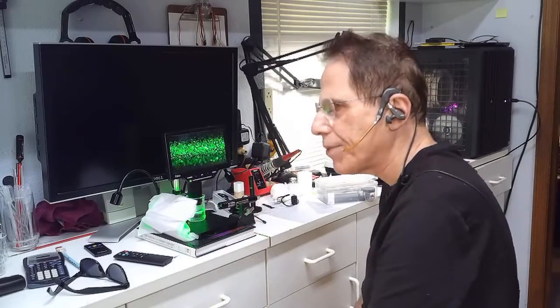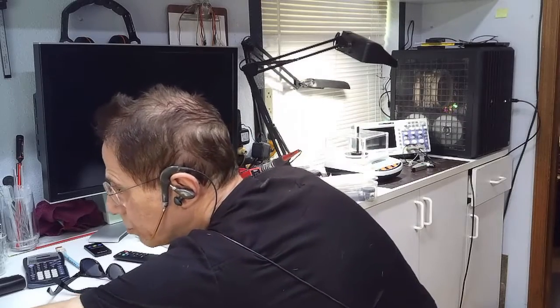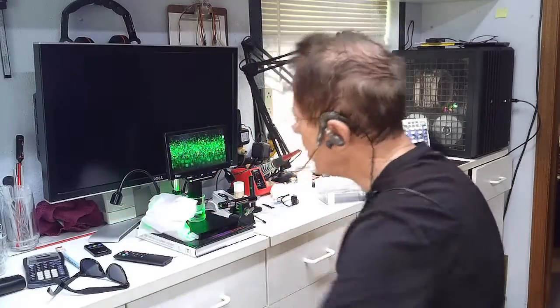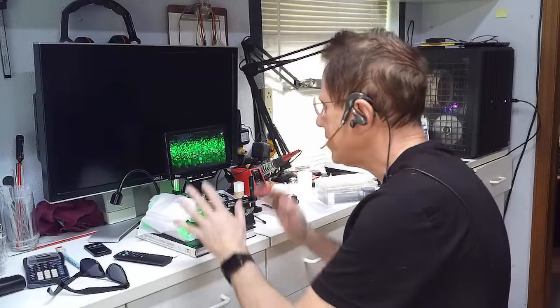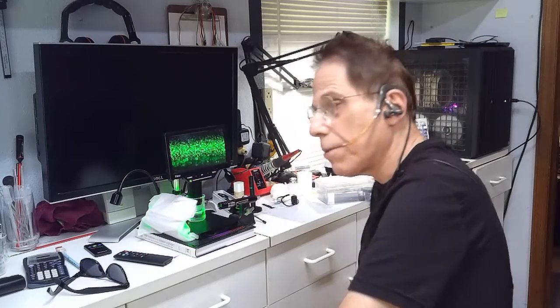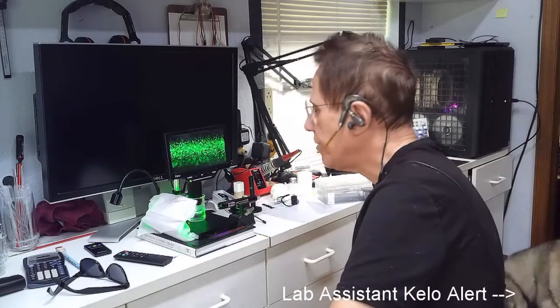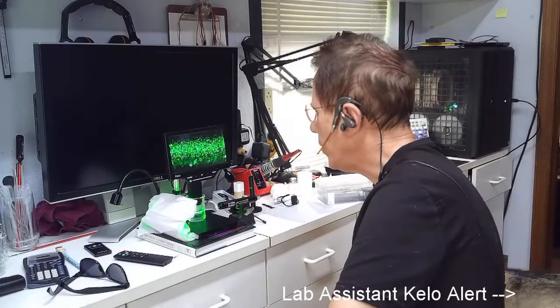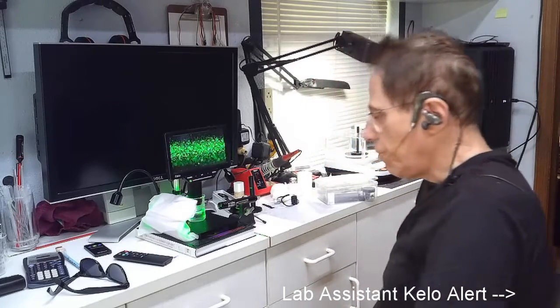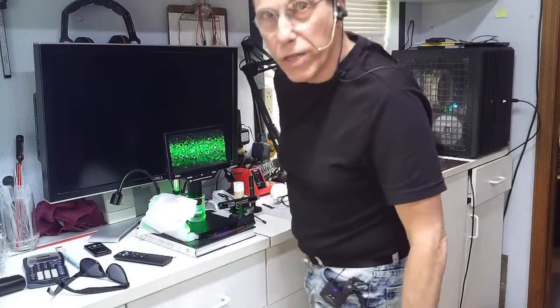This is going to feed into a future video about aggregation that I'll get to later. This piece of equipment has become practically invaluable for me in learning about colloidals and everything going on there. You'll see more of this as time goes on. Now let's move on to the next piece of equipment.